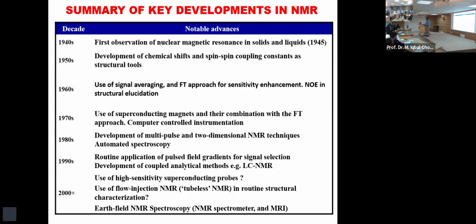NMR is more like a family. Protons of molecules are like families, but they all have their own character. Their character, physicists can never measure. Only chemists can measure their character. It doesn't mean that they have a bad character. They have only different character. Okay.